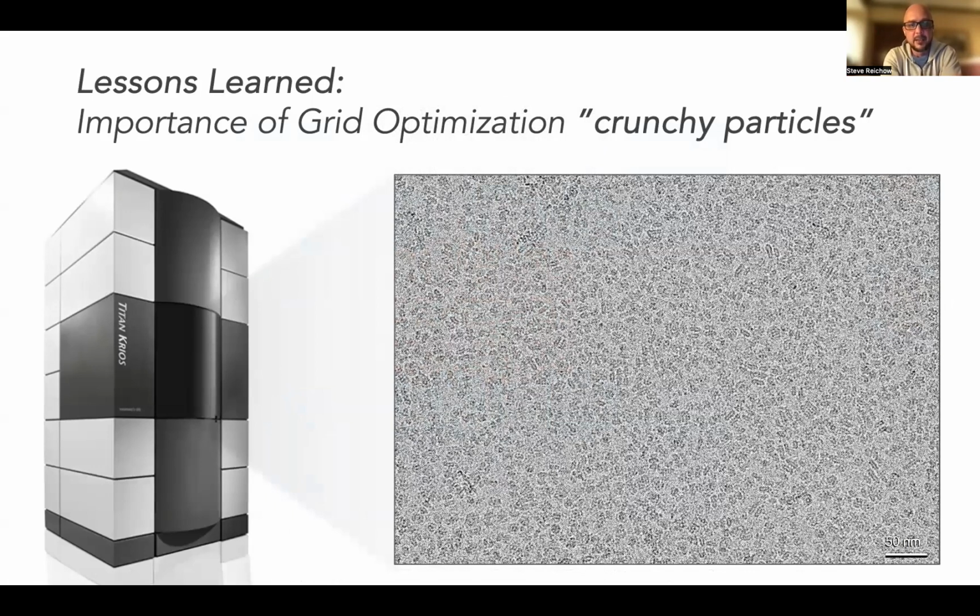And you know, we've been able to collect data sets on this system on many different types of hardware, different types of camera, energy filters, without energy filters, etc. And while some of these things can make marginal improvements, I really just want to emphasize the importance of grid optimization, because in our experience, this really has the biggest impact on the outcome of the final reconstruction.